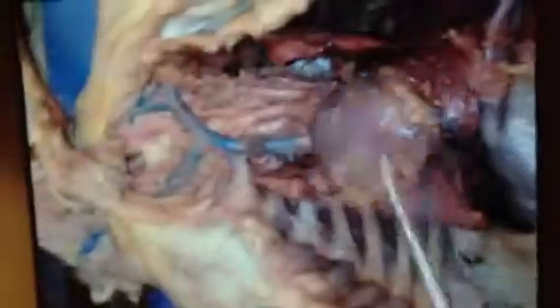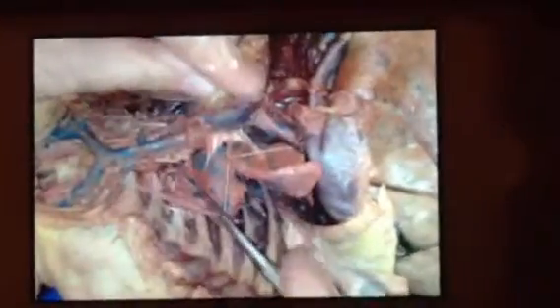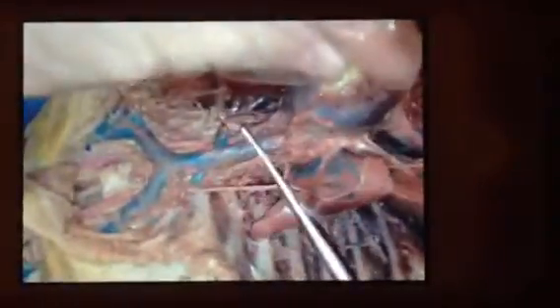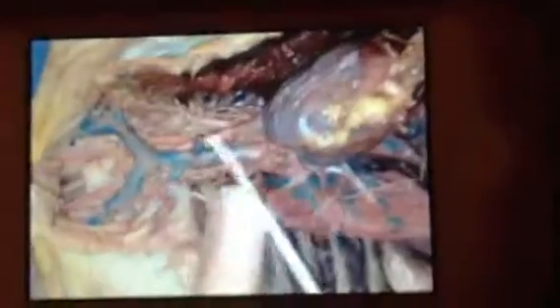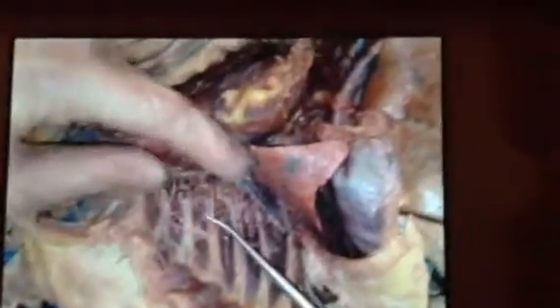Now, back up here that connects from the diaphragm is our phrenic nerve. Phrenic nerve. And that's going to be on the right side in this case. And then the smaller one, which is right here, I believe, is the vagus nerve. And same thing with the posterior intercostals, like I said. This would be the posterior intercostal nerve, the white one.